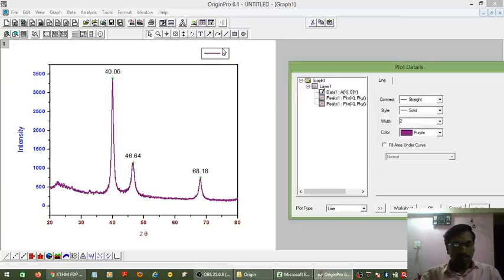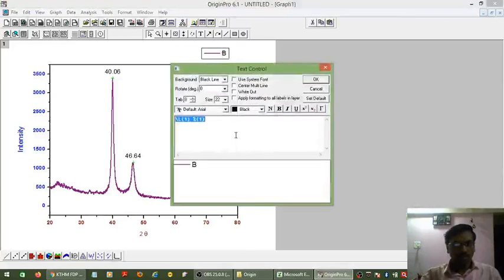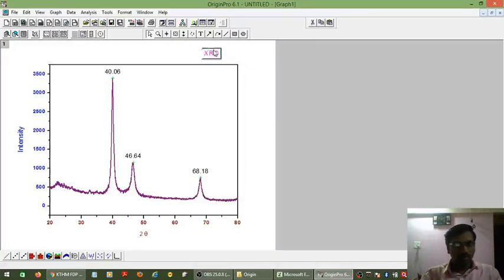You can give a name, say OK. You can give a name for this. It is XRD. Make it bold, give color, say OK, take it inside.